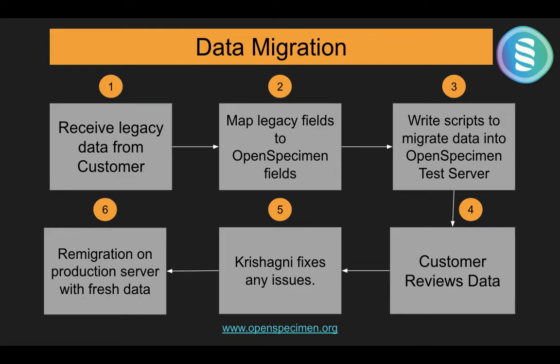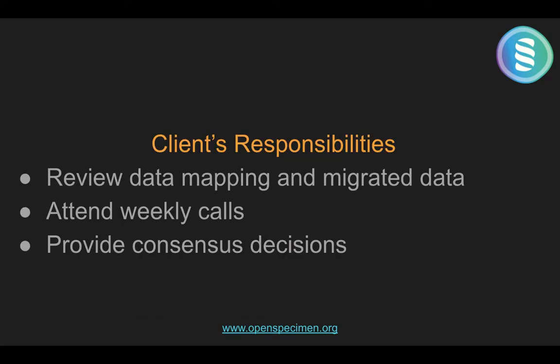Once this is done, we will move towards the go live. We will re-migrate all the data on your production server with a fresh export. So this is the overall data migration process.